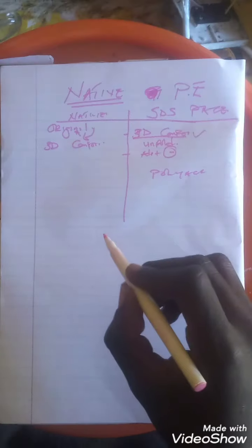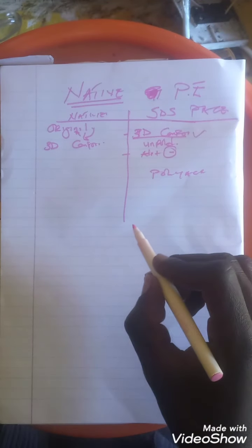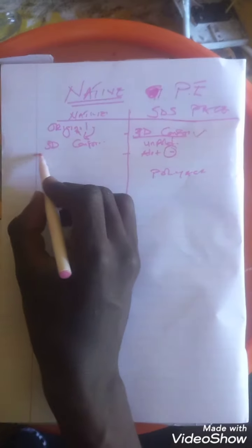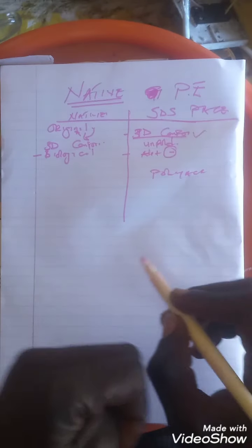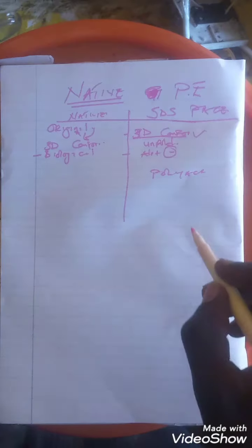Two is that they keep their shape. Yes, they're folded, and they are not denatured. Nothing is added to them for their denaturation. So the proteins are biologically or catalytically active, and they keep their shape.